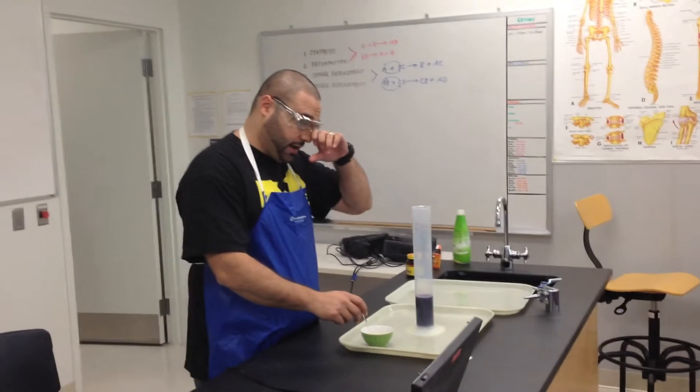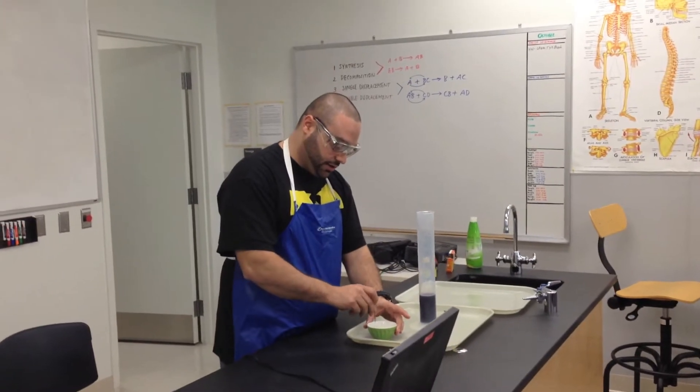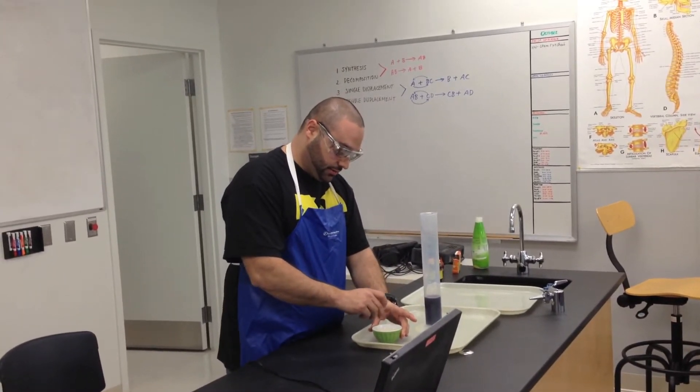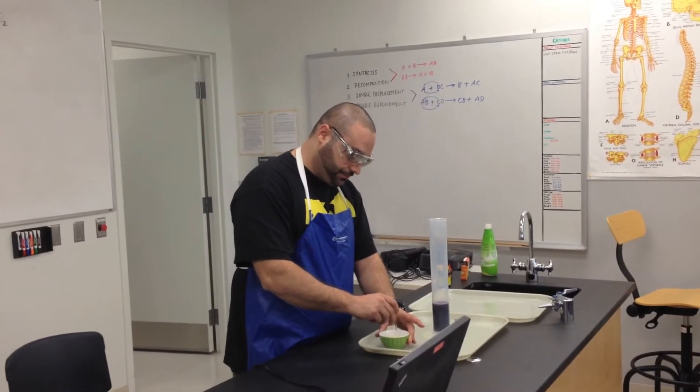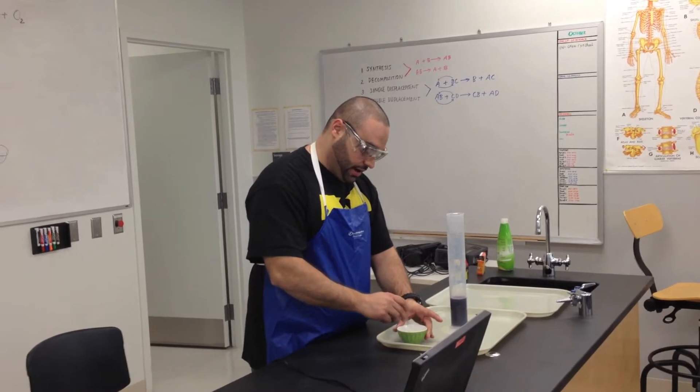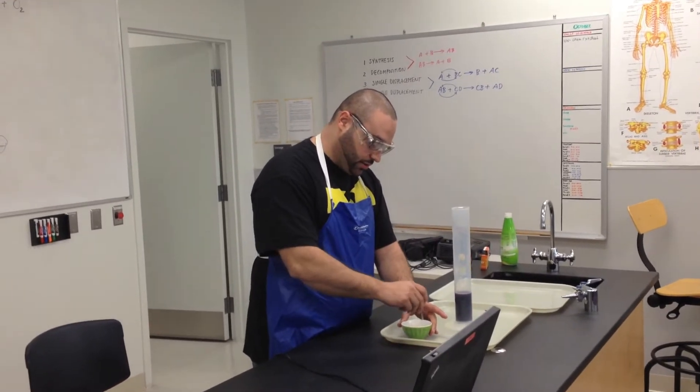Remember, the yeast is just to make the reaction go faster. Right now the hydrogen peroxide in here is decomposing — it's going through a decomposition reaction, breaking down into water and oxygen. I'll explain why the soap is in there and what you're seeing.